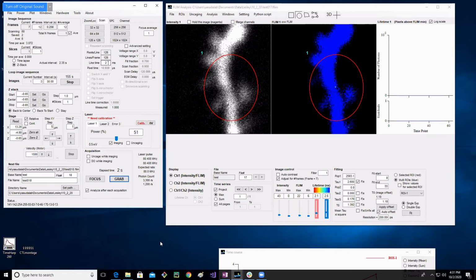So if you're really desperate, you can scan slower and get more photons. But again, this is something you'd want to keep constant for your whole set of experiments probably. So this is something that you shouldn't just change experiment to experiment, but you'd have to talk to your mentor about it, just so you understand what it is.